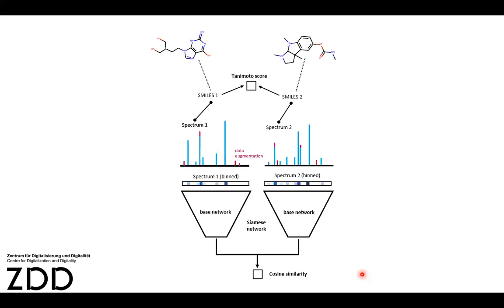This means that we have 2 spectra, and we know ideally what the Tanimoto score between these 2 spectra is. Now we ask the network, please predict the score for them, and this is how it learns. Whoever is not into machine learning, be skeptical about anything with the word intelligence or learning in it.